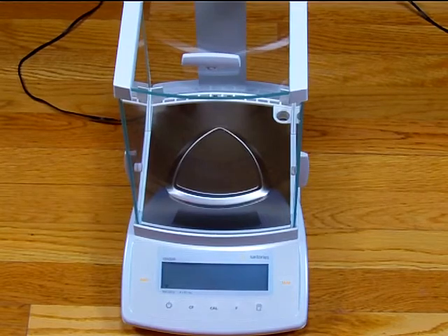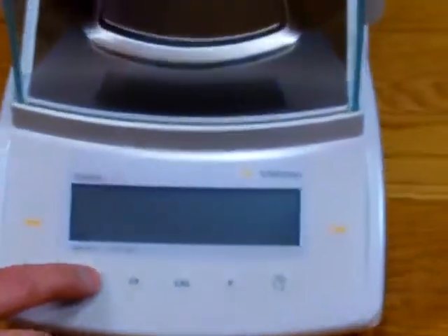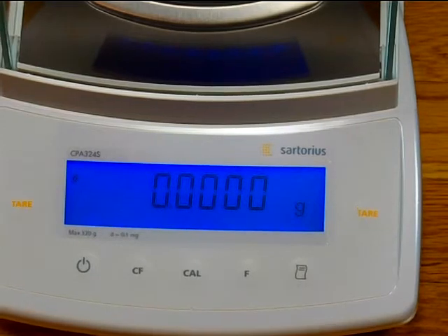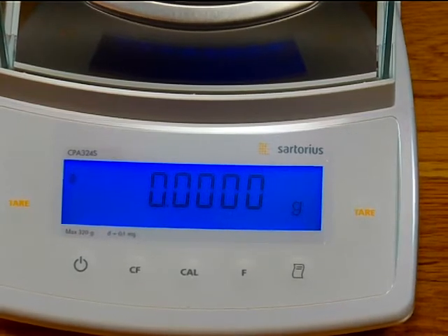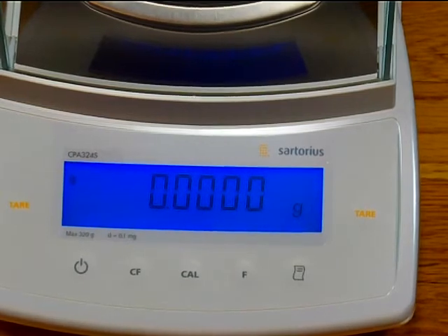Let's show the balance on and some of the features. To power up the balance, one simply presses the on button — the left-hand button. It does a power-up sequence, and you'll notice the balance has a beautiful blue backlight display. This display is adjustable in the menu. You can see the balance is in grams and it's four decimal place.